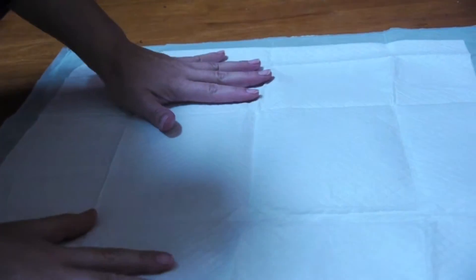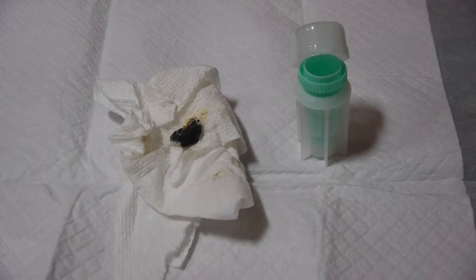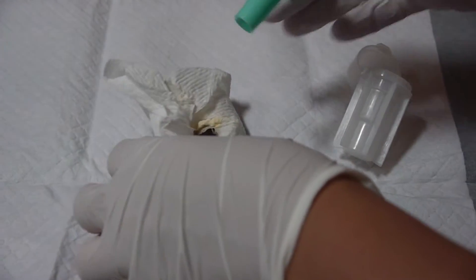Here we have our fecal sample. The fresher the better — try not to test a sample more than 24 hours old. Remove the center part from your fecalizer and collect a small pea-sized amount of matter in the bottom.